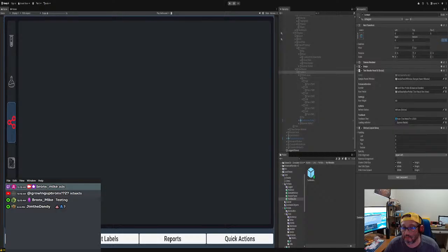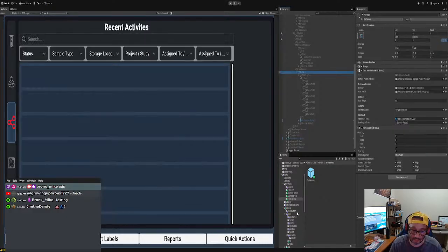All right, so we don't want to use just the test results from the demo. We are going to grab it from the test results service, correct? So following that pattern, we are going to build the test results service, okay? I remember I did that, so I made sure that we cover that.